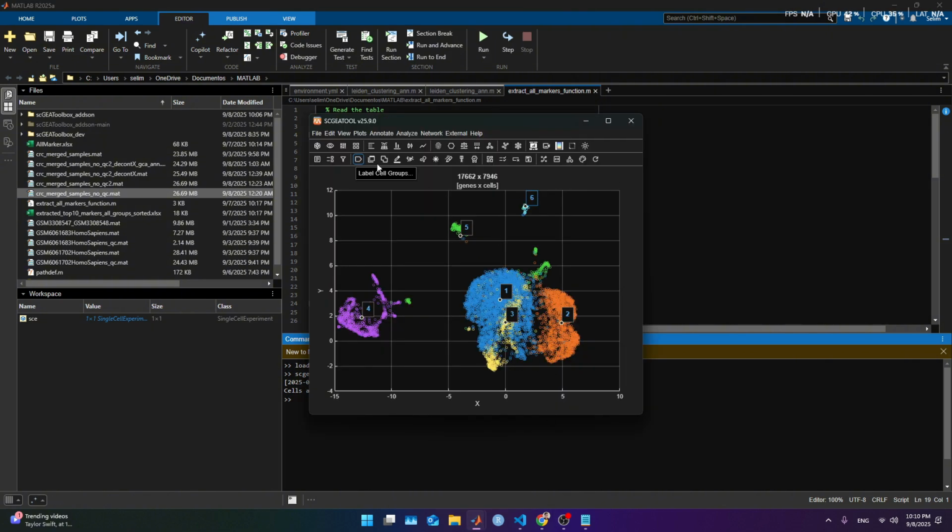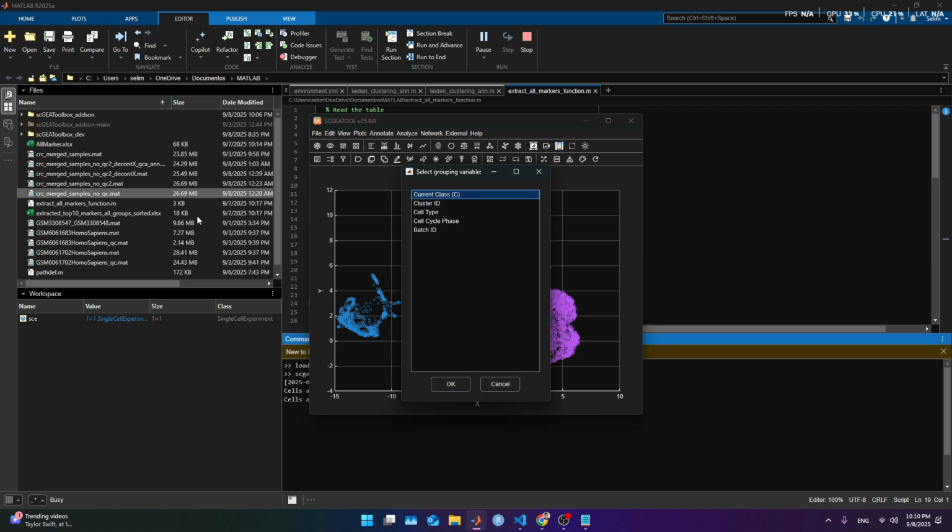Yeah, these are the current clusters we had before, and the cell types were like this. We verified that fibroblasts and macrophages are correct, but enterocytes and neurons we have to double check. So what I want to do today is find the markers again and sub-assign those cell types to the clusters as we did before.